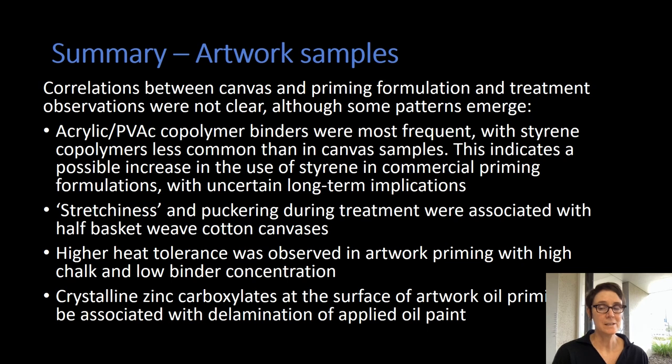Correlations between canvas and priming formulation and treatment observations were not clear, although some patterns did emerge. Acrylic PVAC copolymer binders were most frequent in the artwork priming layers, with styrenated acrylics less common than in canvas samples. As the canvas samples post-date the artwork samples, this indicates a possible increase in the use of styrene in commercial priming formulations, with uncertain long-term implications.